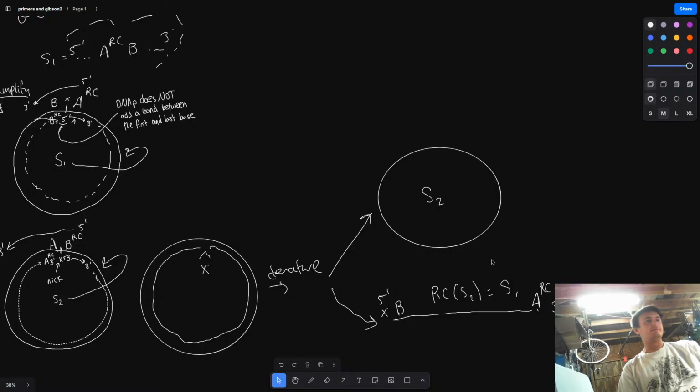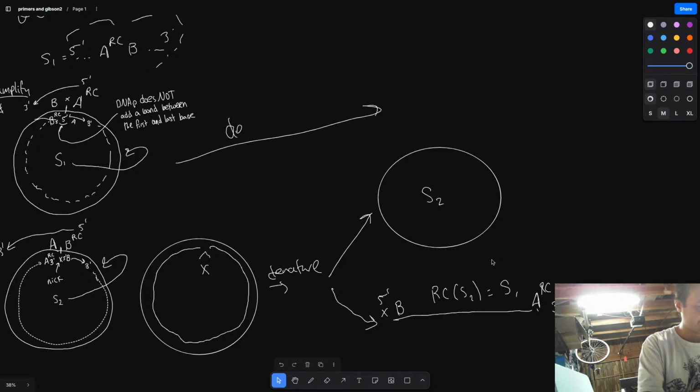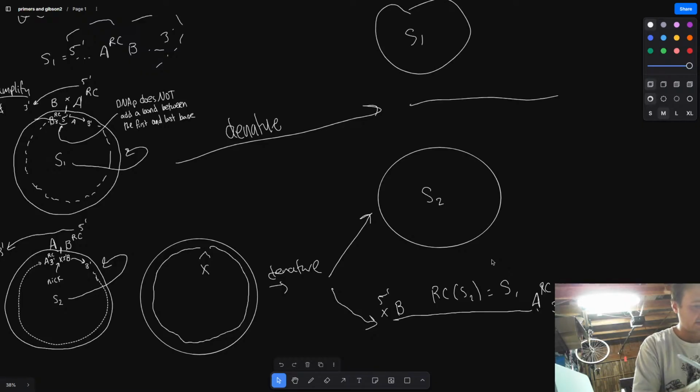Okay. The same thing is going to happen to this one. I'm not going to draw the diagram again, but basically, here, denature. And I'll just do this: S1 and then S2.